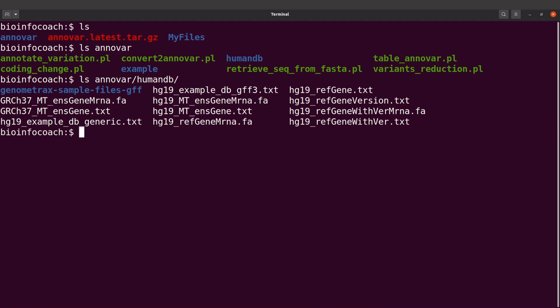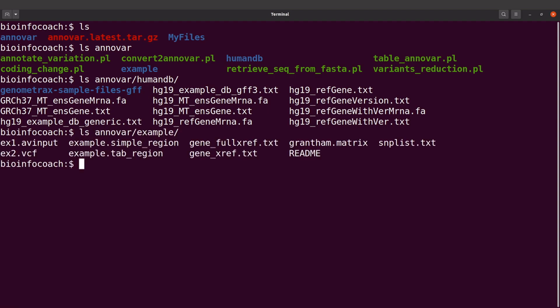Let's also take a look at the example data that we can use. ANNOVAR comes with example data and you can find that in the 'example' directory. We'll do 'ls annovar/example' and we are going to find some files there. We are going to use this VCF file for our demonstration.